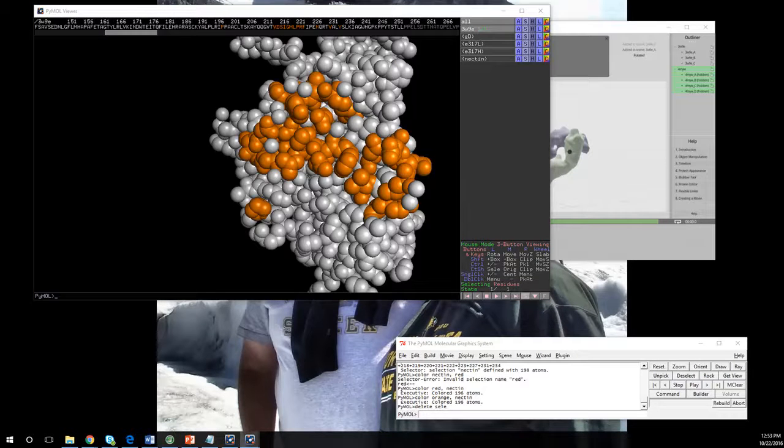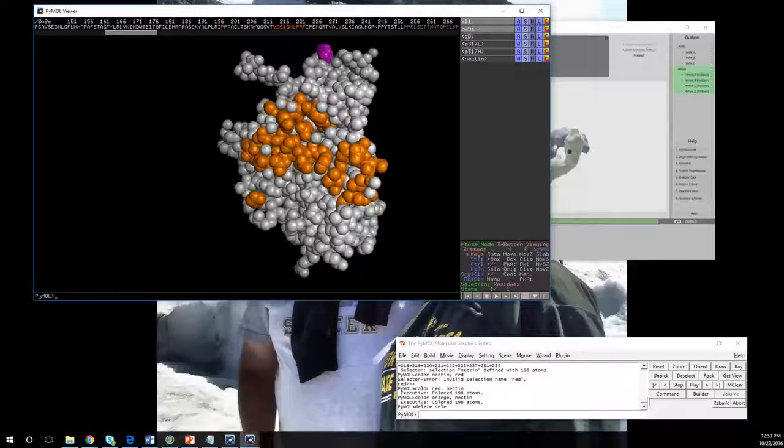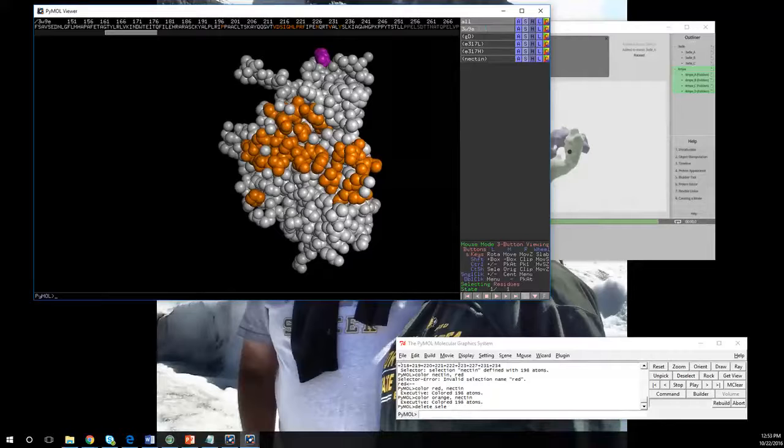Okay, so one thing that you're going to want to be careful of, and I'm using the right mouse button. I had to figure this out because I forgot. Sometimes PyMOL's funny. One thing you're going to be concerned about with spheres is that spheres hide a lot of things. I really like the way spheres works, but it kind of obscures some labels. So one of the things that I would recommend doing is hiding the spheres.